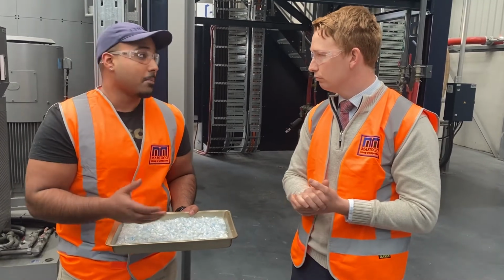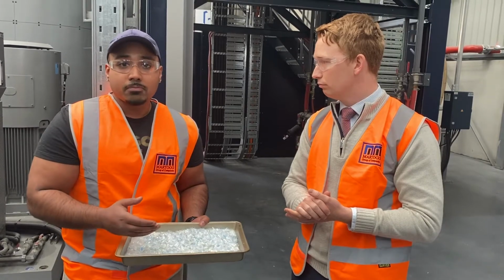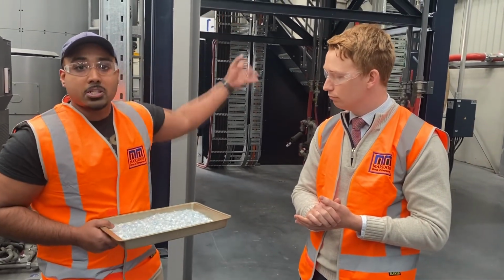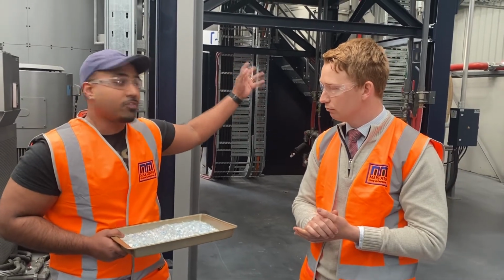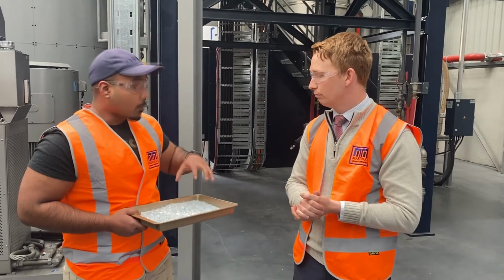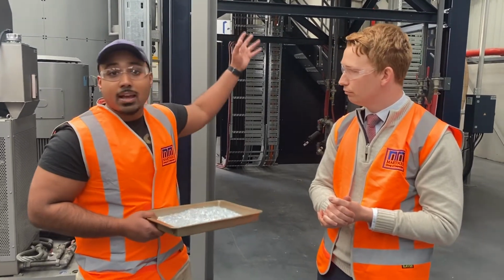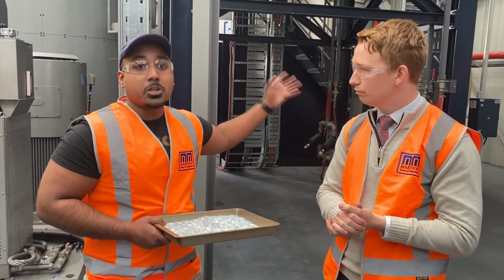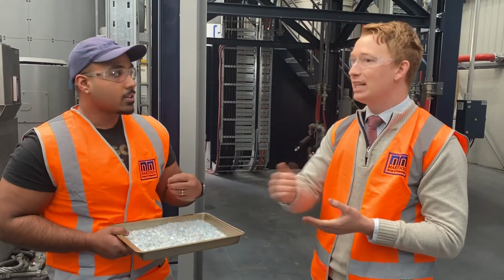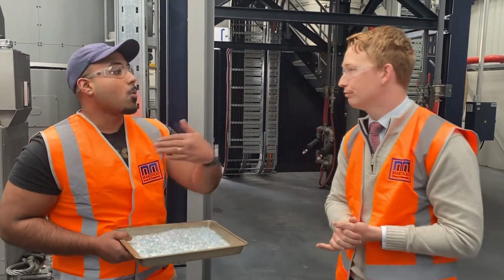What we try to pick up is contamination. So that level of contamination is obviously then quantified, and then we make sure that it's all right for this machine to be processed through. Obviously the machine has flake specifications. Then we need to make sure that these requirements are met with the raw materials that we put in. So the machine and the technology that we have is good enough to let us know if there is something that's abnormal, or if we see contamination, it will pick up. We'll pick it up. But obviously we don't want to get to that point.